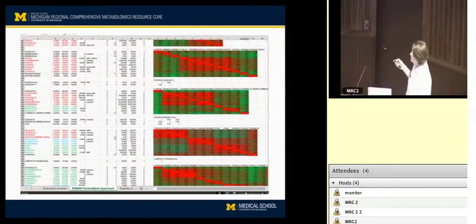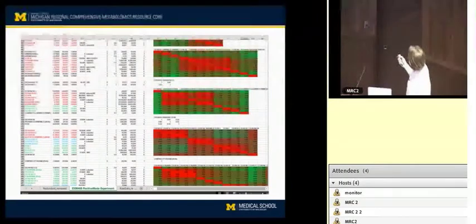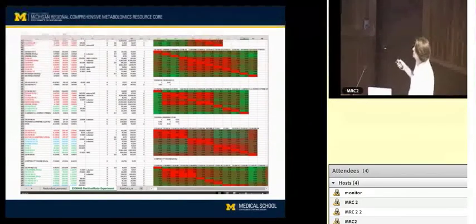And you can start to see, this is just a great visualization tool. If you arrange the data in clusters, you can see that each of these clusters actually has like 3 subclusters, maybe 4 in here. So we believe that this really only represents 3 features, even though there's probably 15 or so peaks there, or 13 or 14 or whatever it is. So then the trick is really to figure out what's the one feature that we want to retain from that bin.